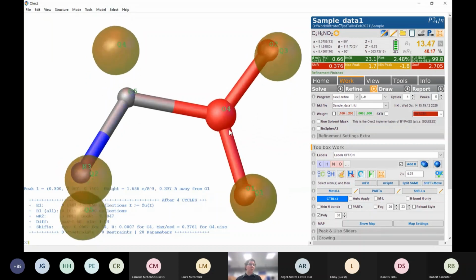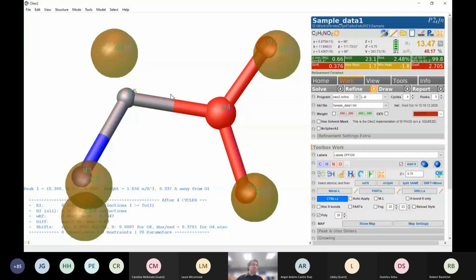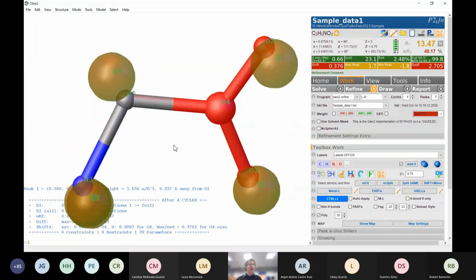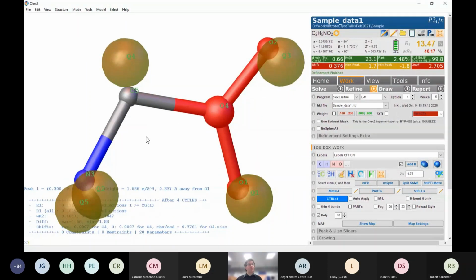Generally, what you actually want to see when you've got a good set of data and your atoms are probably correct is they all should have roughly equal spheres of radius. Now, one thing that will happen is that anything that's terminal will generally have a slightly larger sphere than atoms that are bound to multiple other atoms, held within the core of the structure.